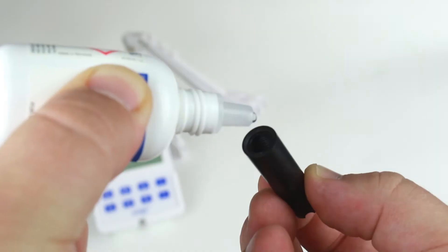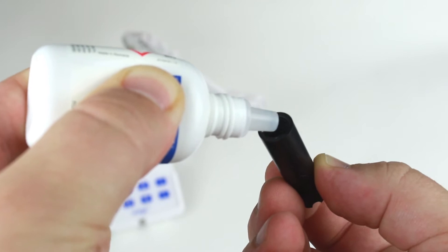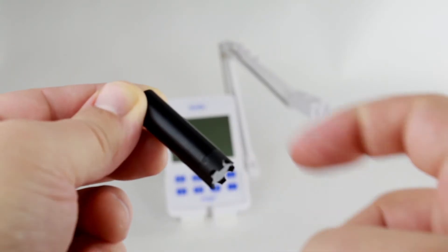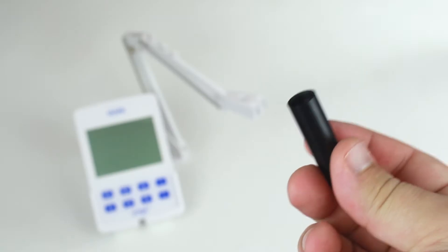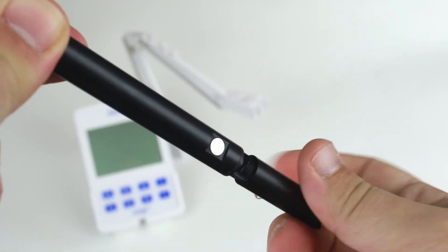Once the O-ring is in place, we can start filling the membrane cap with electrolyte. It's important to fill the cap about three-quarters with electrolyte. Tap on the side of the cap to make sure that any air bubbles rise to the surface. Once there are no air bubbles, screw the cap onto the probe. Some electrolyte will spill out — this is normal.